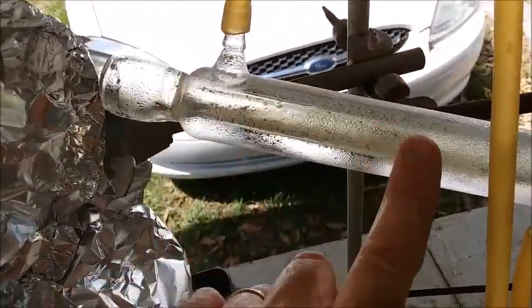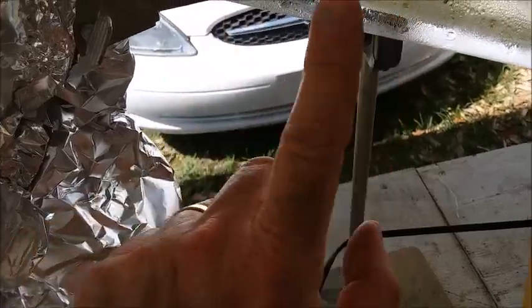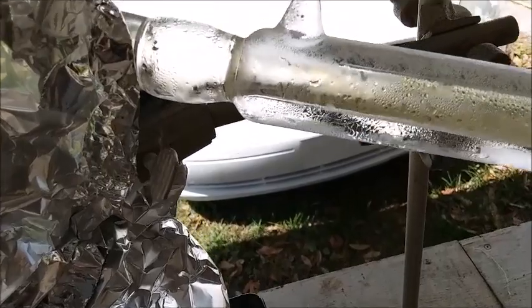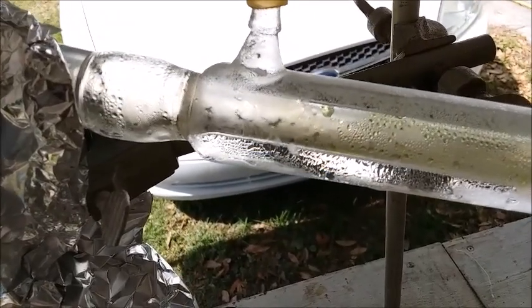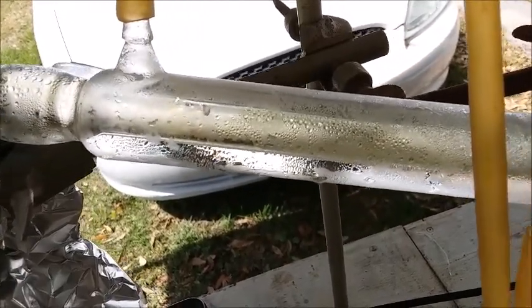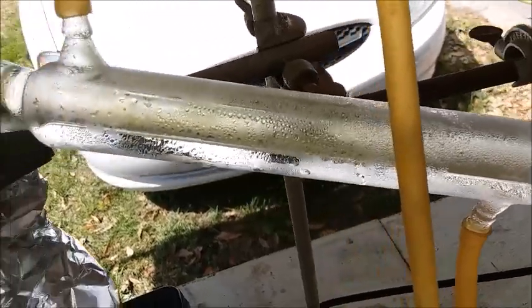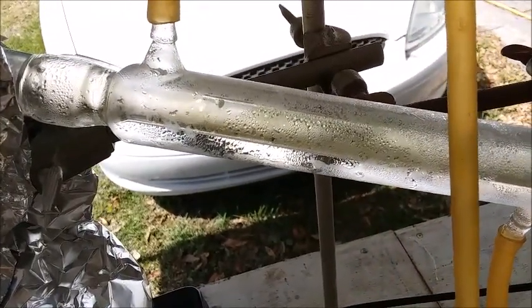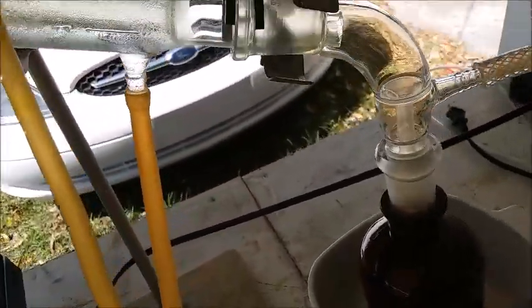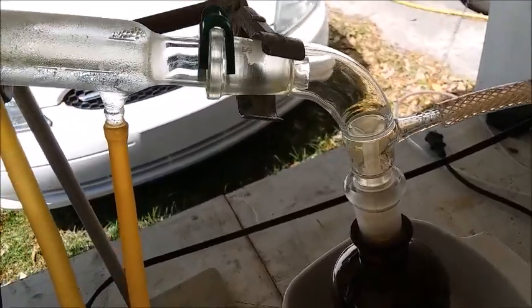You can see that the acid is condensing in like the first inch to inch and a half of the condenser up there. If I was using tap water, especially in the summertime when the tap water is not particularly cold, it would be condensing all the way down. This is looking good — the orange fumes have only just made it down here, so this is pretty good.